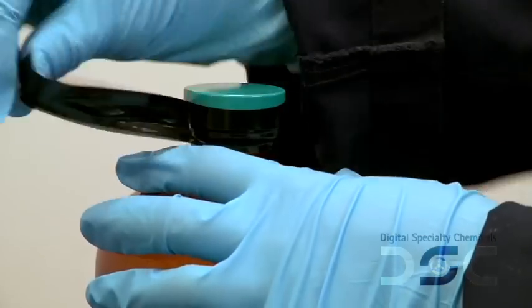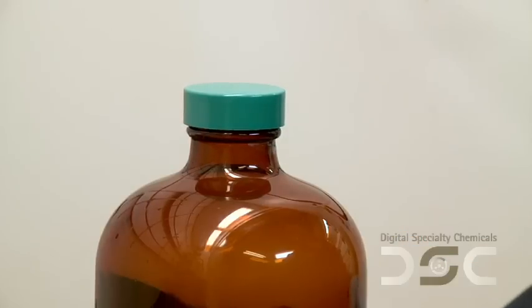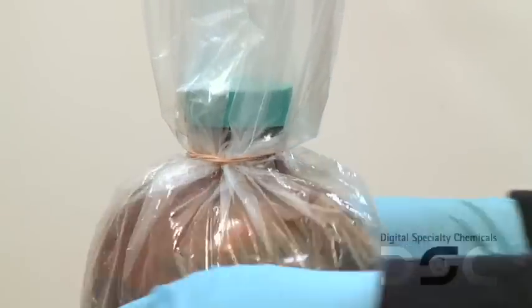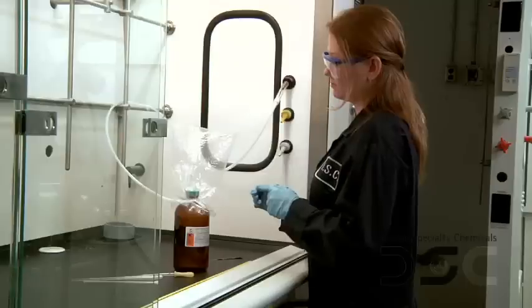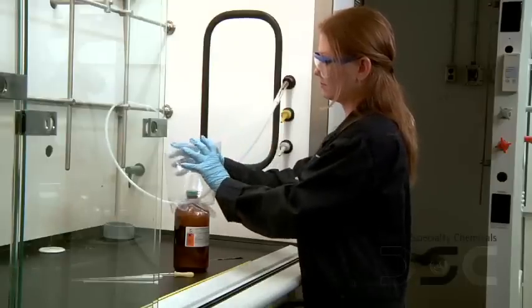Remove any seal that may be found from the bottle lid, but be sure not to open the lid at this point. Attach a clear plastic bag using an elastic band over the top of the closed bottle. Insert the nitrogen line into the plastic bag between the bag and the neck of the bottle. Purge the bag four times with nitrogen by first filling the bag with nitrogen and then pushing the nitrogen out.